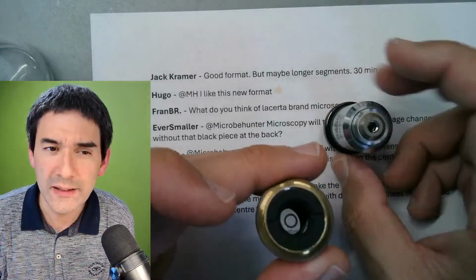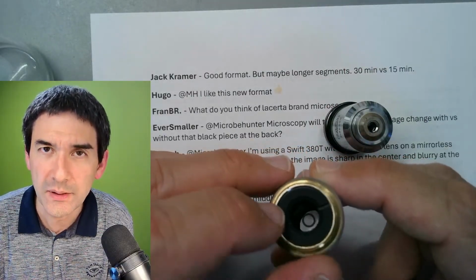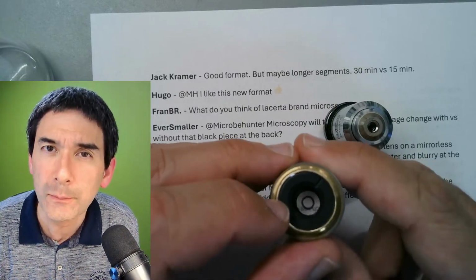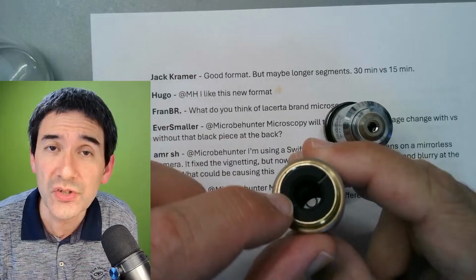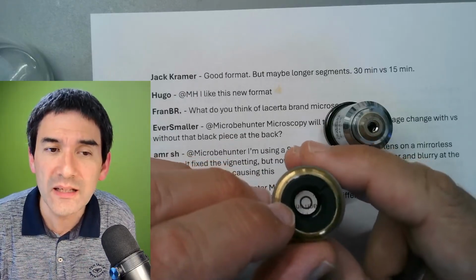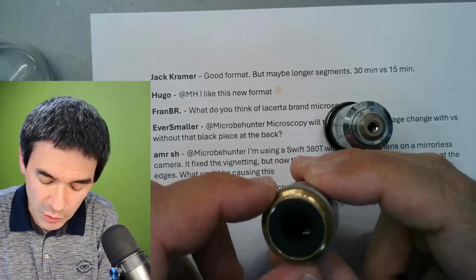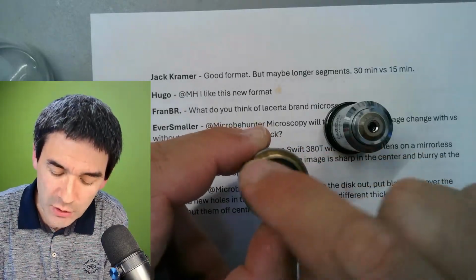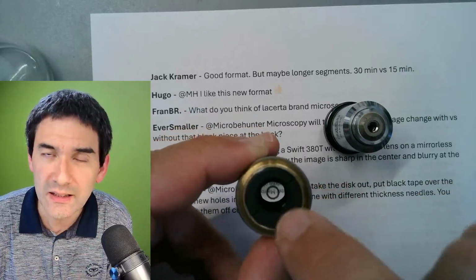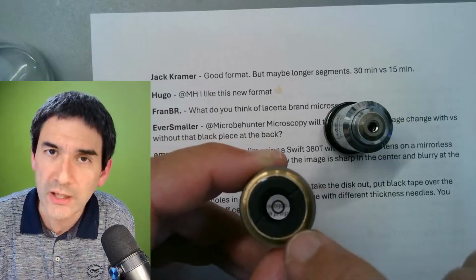I've not tried that. In telescopes they're called baffles, to reduce the internal reflections. I think it could indeed have an impact, but I did not try that out. Some objectives have this plastic cup in here with a small hole in the center, and I think this could reduce internal reflections.